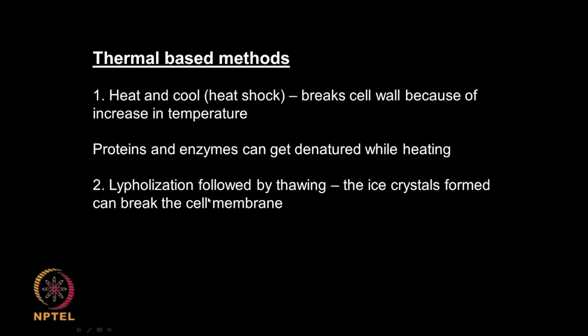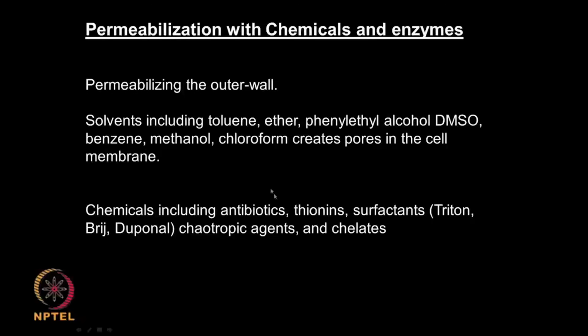Another is lyophilization. You cool it and then you thaw it, cool it and thaw it, and the ice crystals that are formed can break your cells. Okay. This is a better method, because the protein is not undergoing thermal degradation, but this is more expensive than the heat shock method actually.